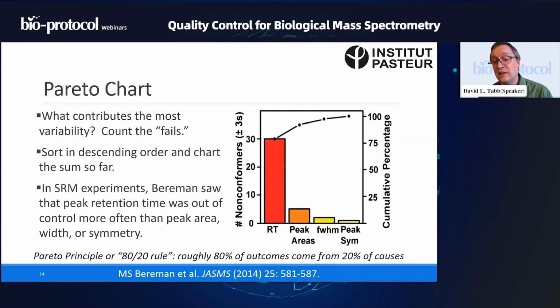And you see that there were 30 non-conforming cases that fell into that case. How many times did we reject a quantitation because the peak area didn't look correct to us? Maybe it was unable to get a decent peak area because there was no signal. So that accounted for the next largest number of peak fails.